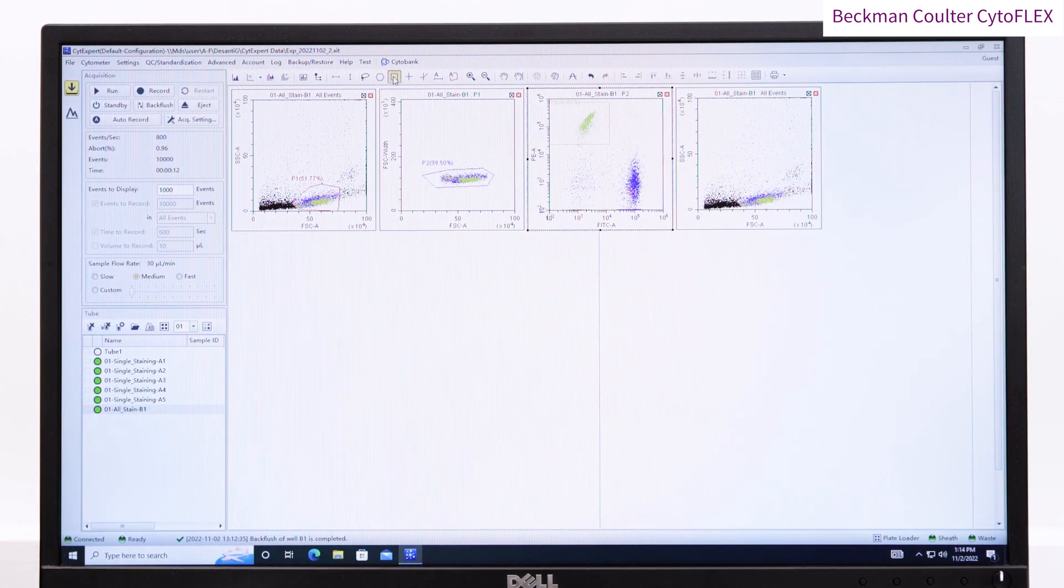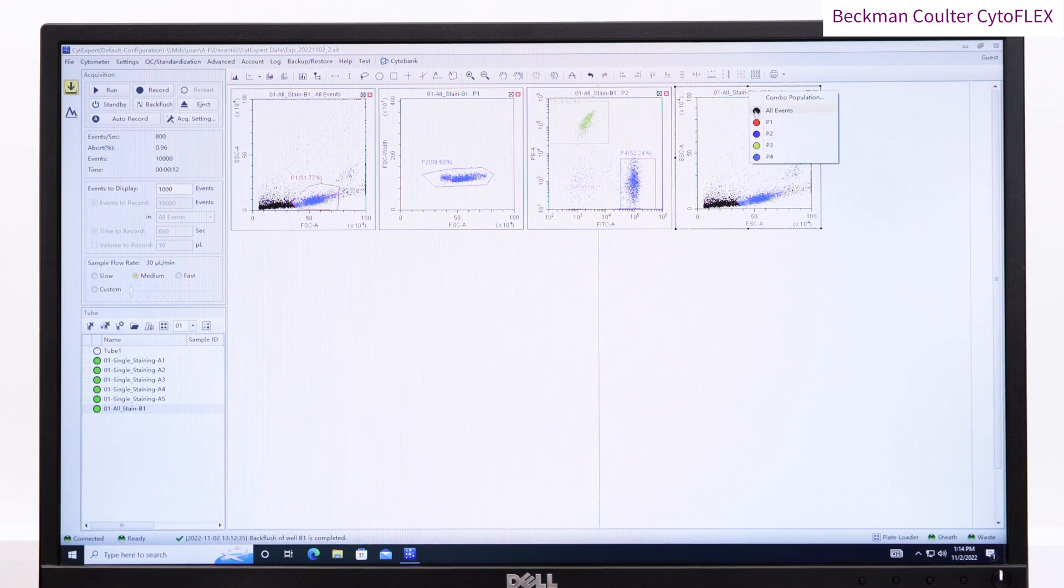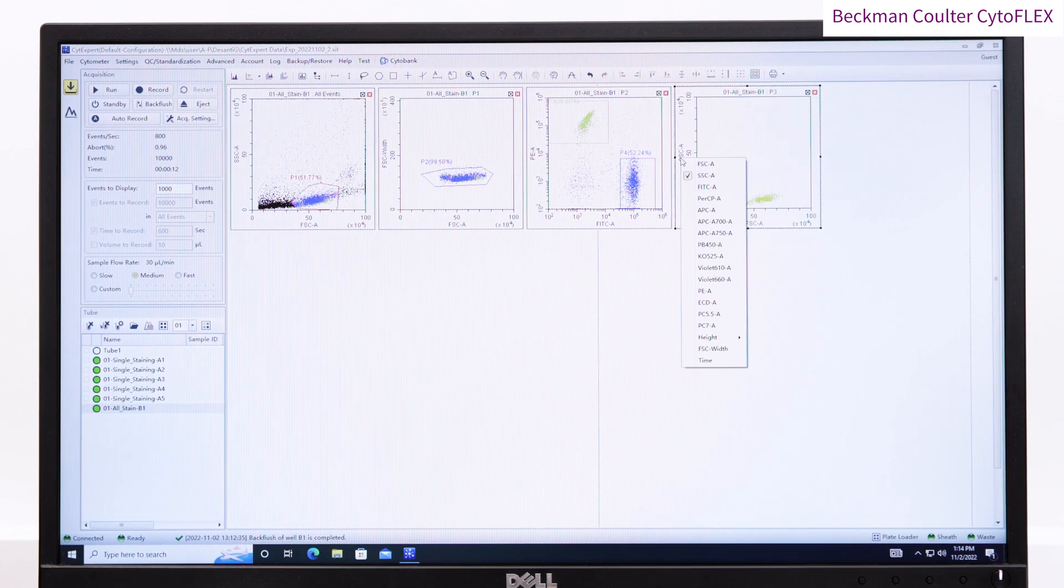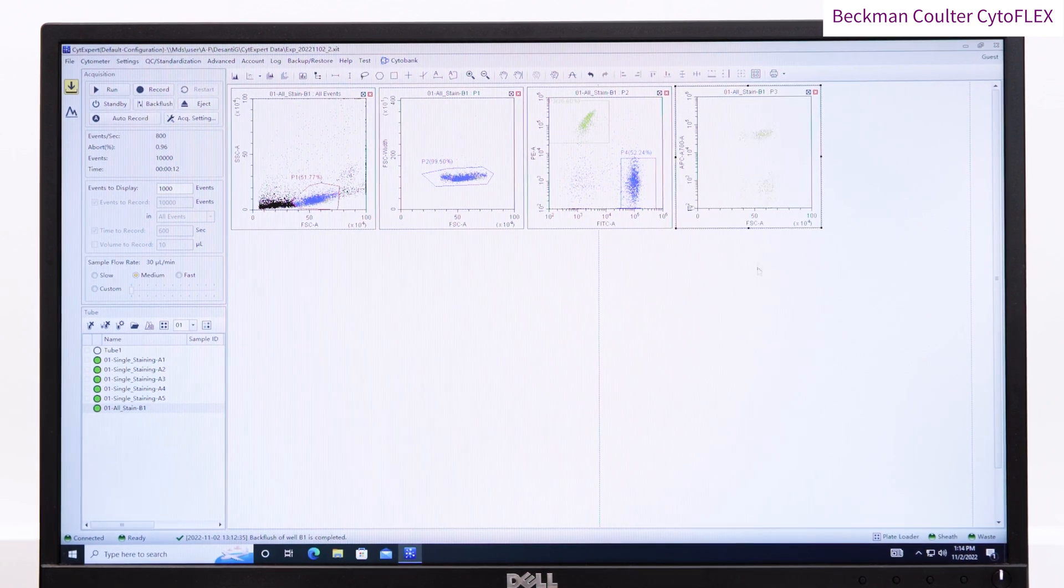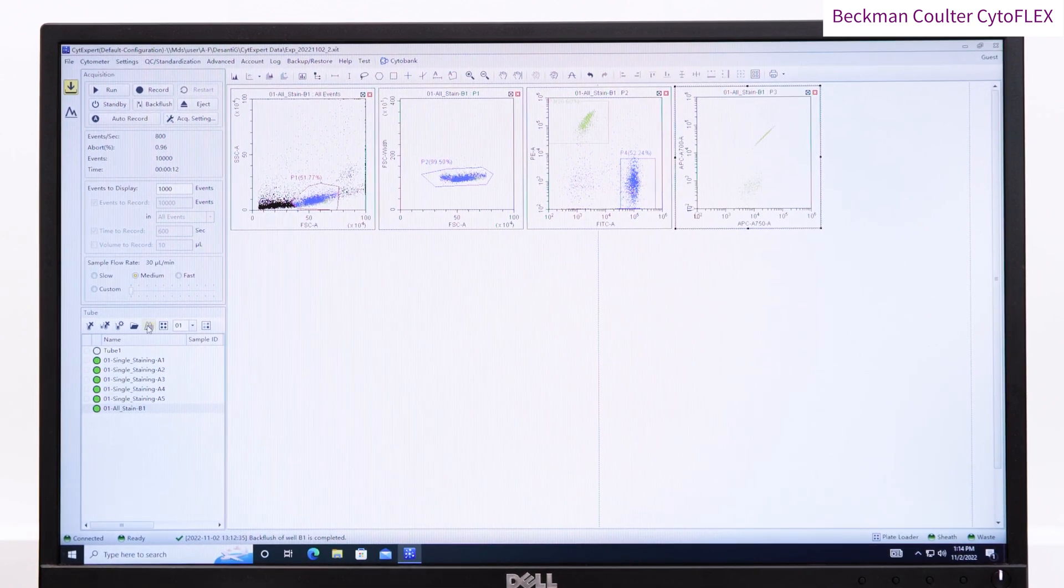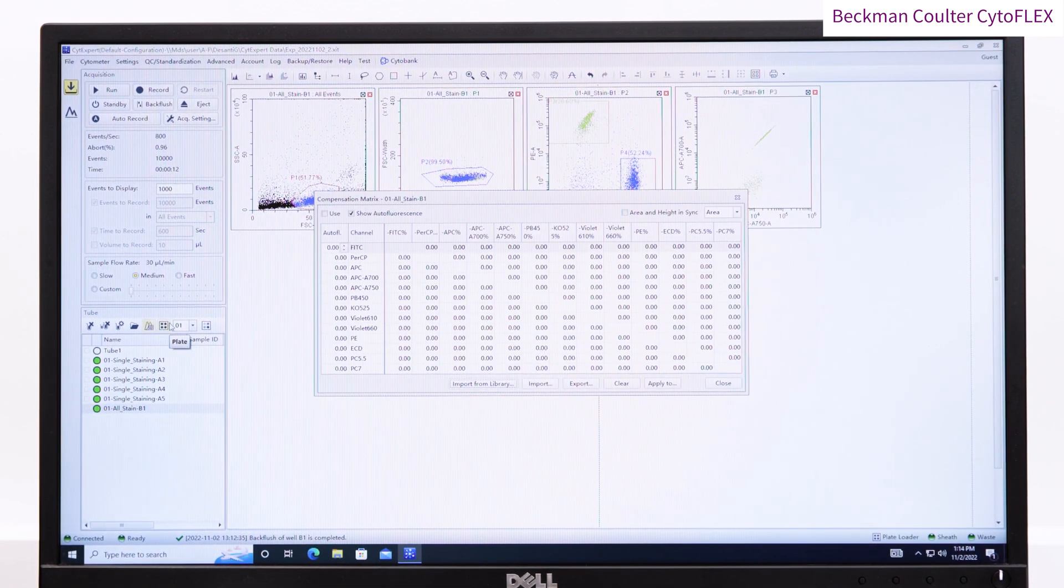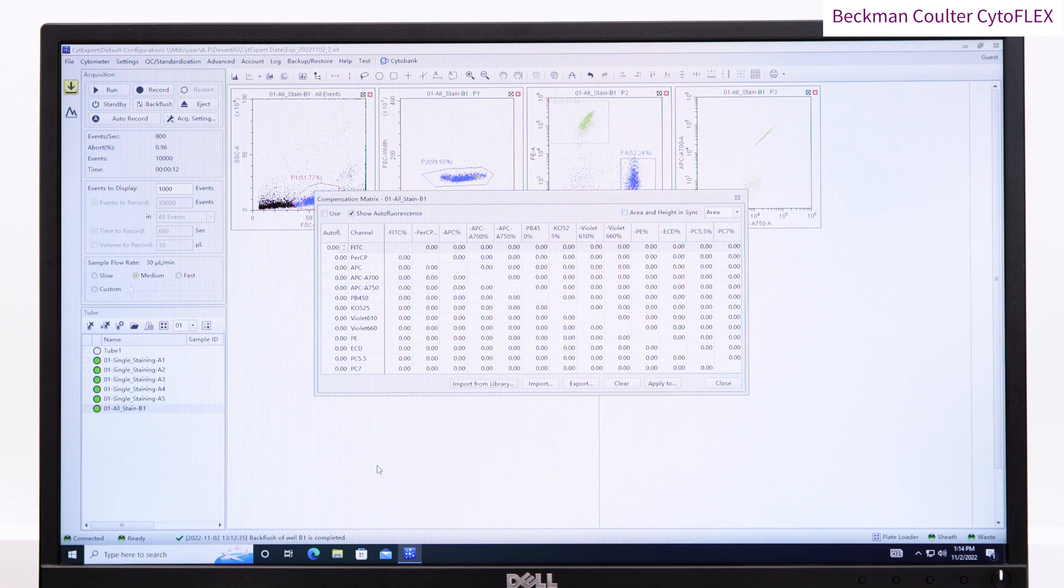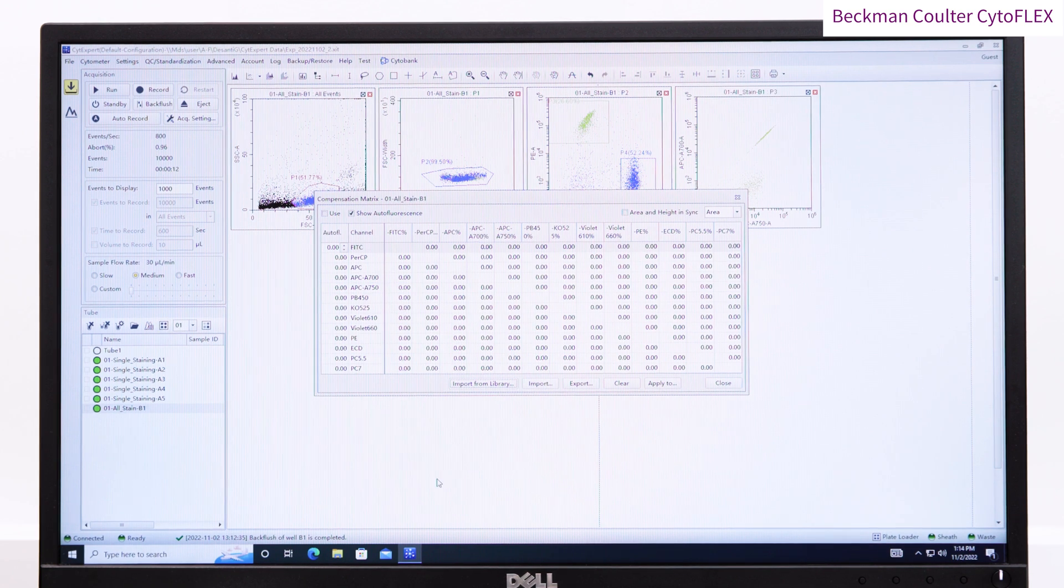You can then go ahead and create appropriate dot plots and histograms, and apply gating as required. So remember, at the moment we haven't applied any compensation.